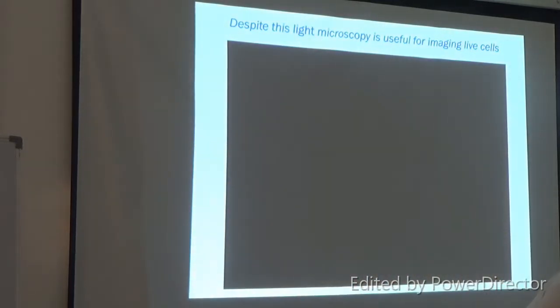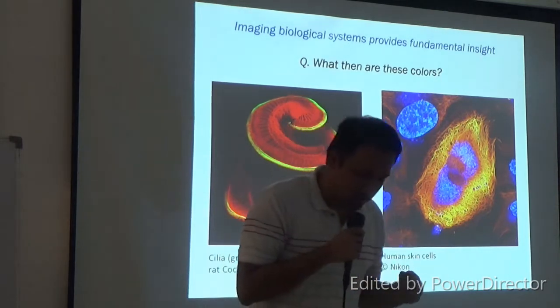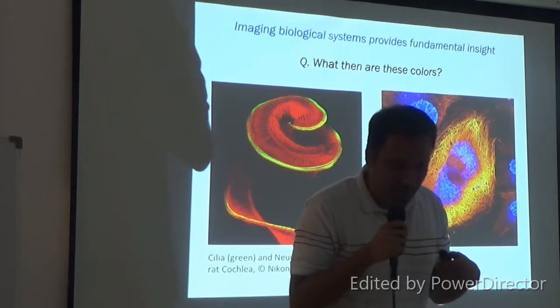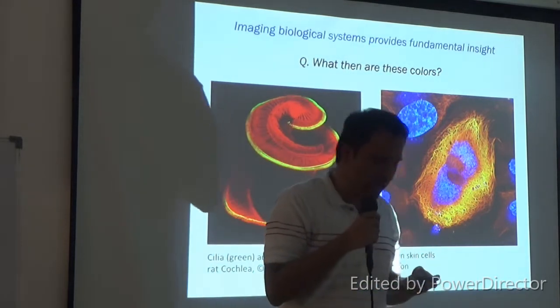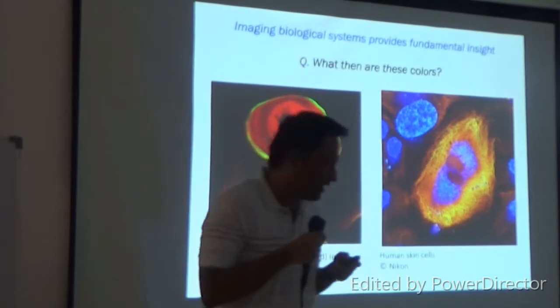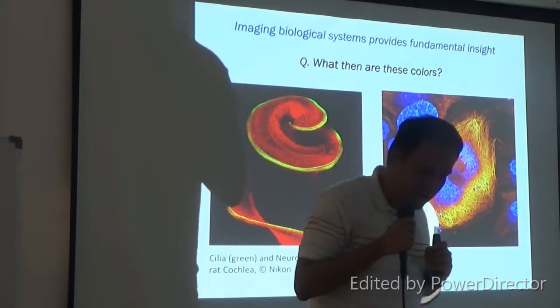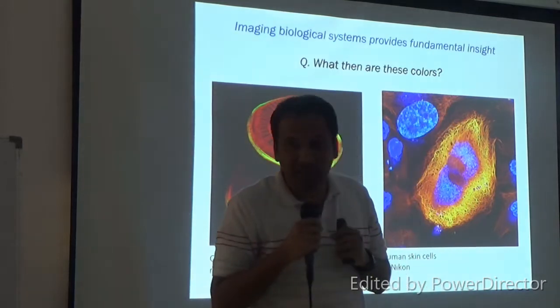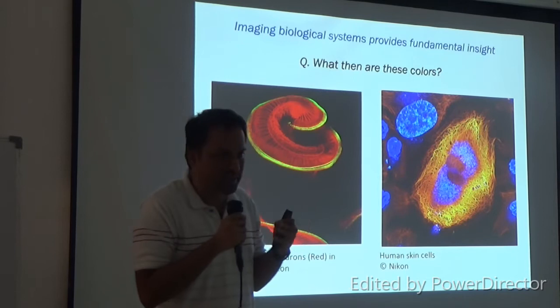Light microscopy makes for some pretty pictures. The neutrophil and red blood cell picture we saw was primarily just white light being transmitted to the sample, and then we are creating contrast somehow. Usually cells are very transparent, but there are methods you can use to create contrast, and we can take movies like that. The other method that people use very often is fluorescence.